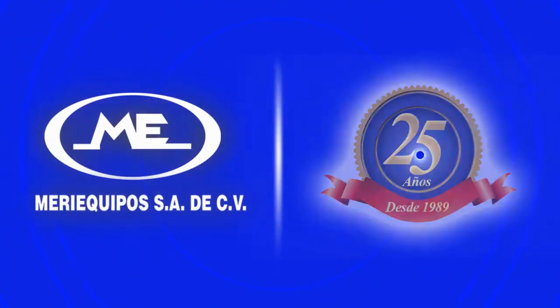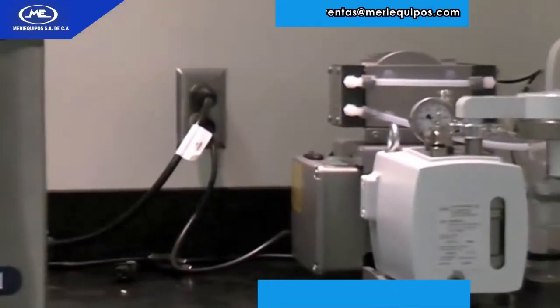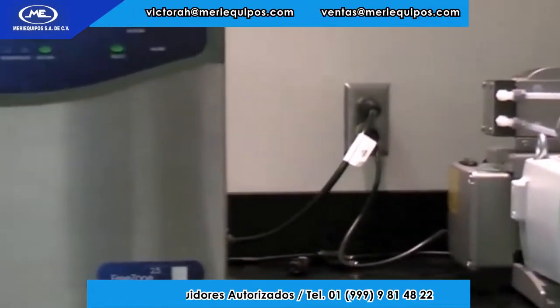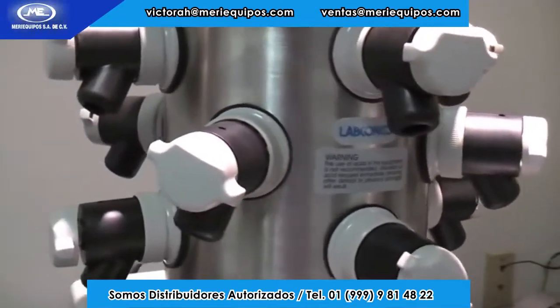Meri-Equipos presents: Setting up a Freezone benchtop freeze-dry system is a simple user-performed task that can be completed in just a few minutes.